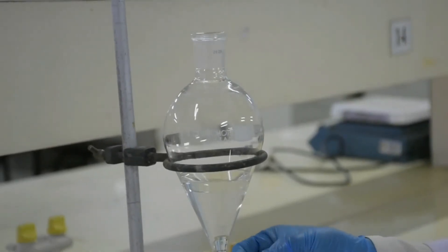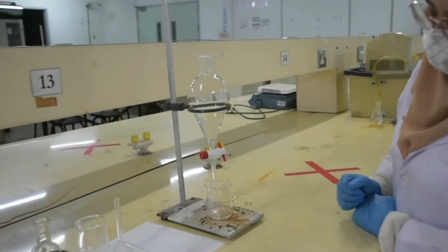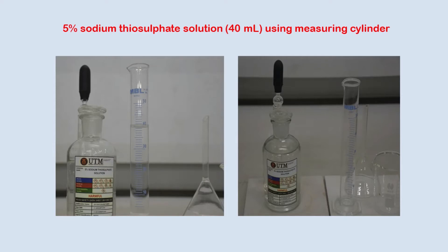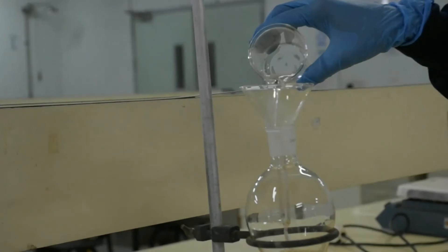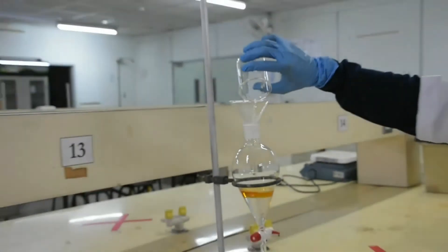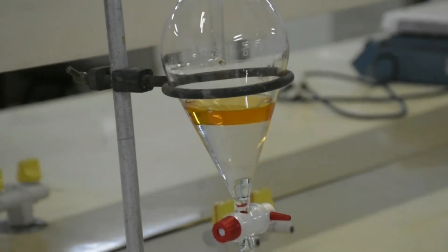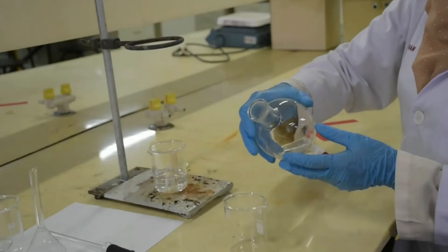Run off the aqueous layer. Measure 40 ml of 5% sodium thiosulfate solution at the fume hood and pour it into the separatory funnel. Repeat the funnel shaking step, then collect the organic layer in a beaker.